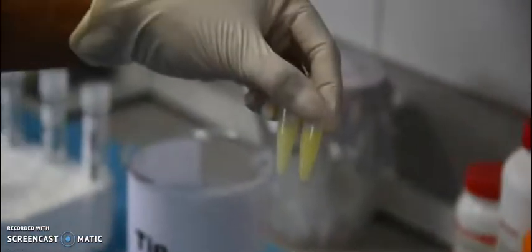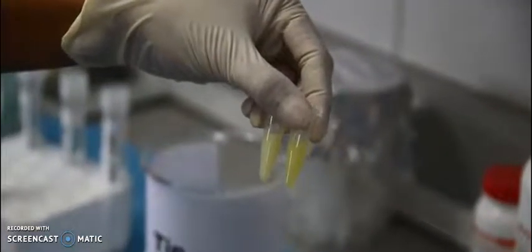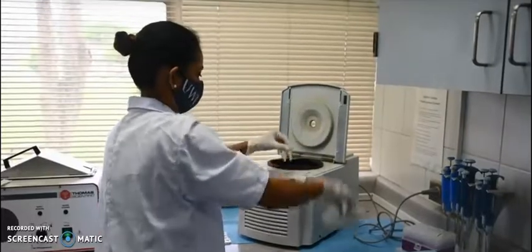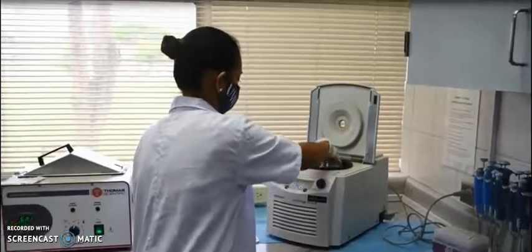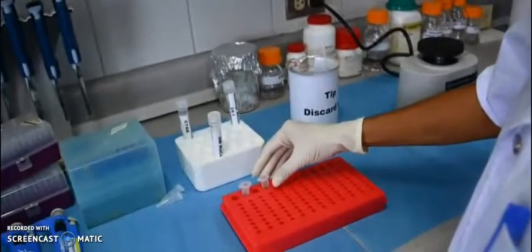After addition of chloroform and isoamyl alcohol, mix it well using a vortex. And centrifuge at 10,000 RPM for 10 minutes. After centrifuge, you will see an aqueous upper layer and an organic bottom layer.